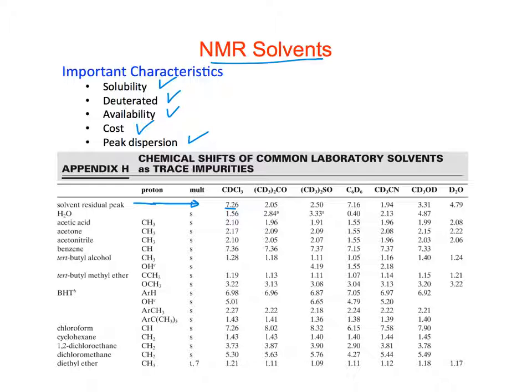Well, I think usually with synthetic samples, when I was just using deuterium, it didn't matter that much. You know, I know some people that put molecular sieves in there as well. But you run the risk of contaminating your solvent that way. Yeah, I'm okay with seeing a water peak. Yeah, and if you have reasonably strong synthetic samples, then I never had to do that.